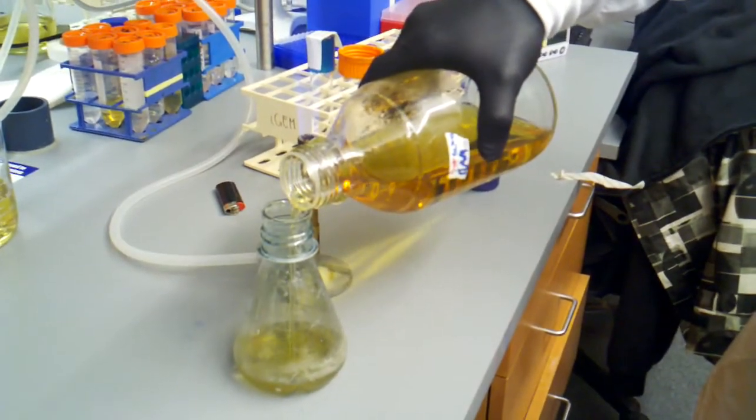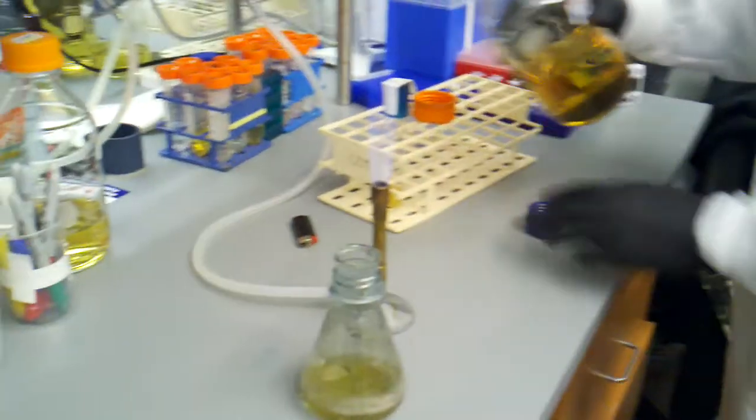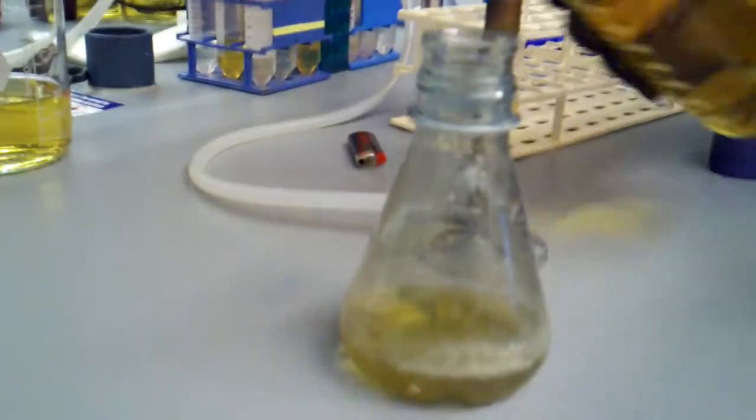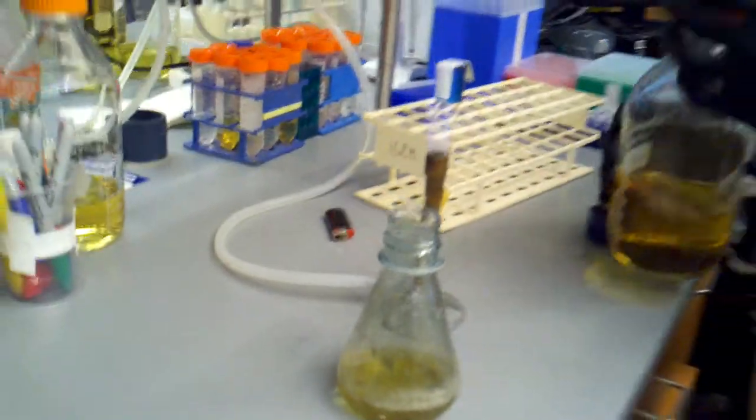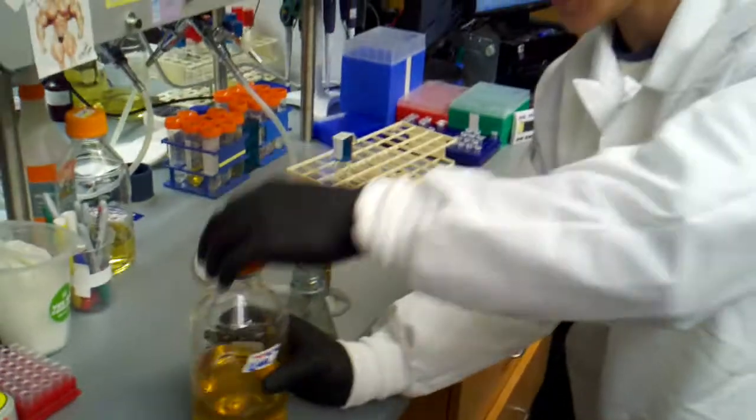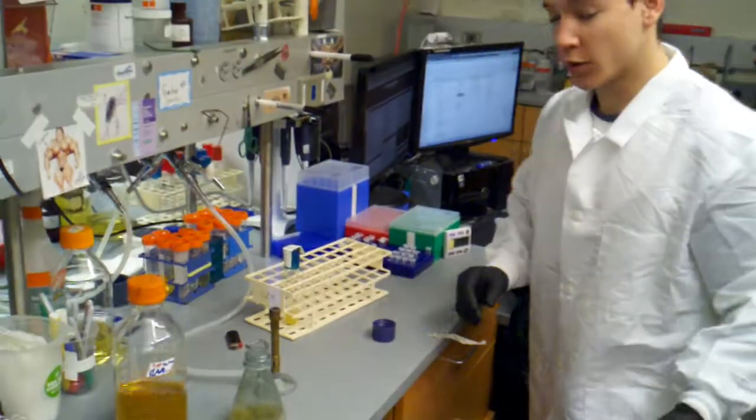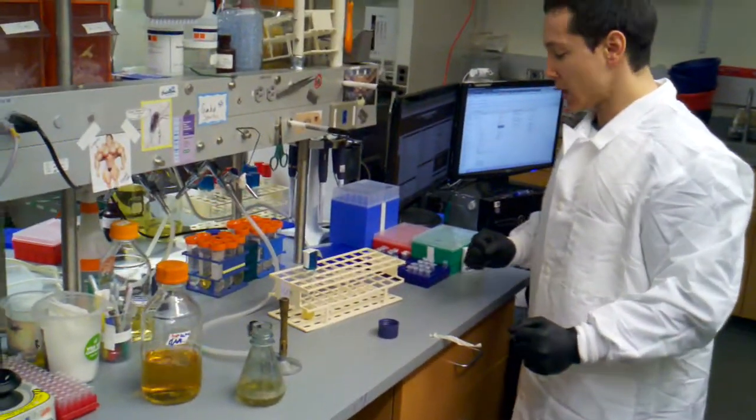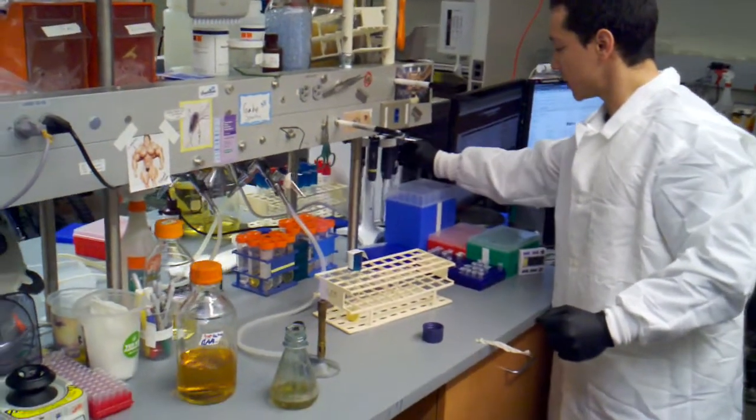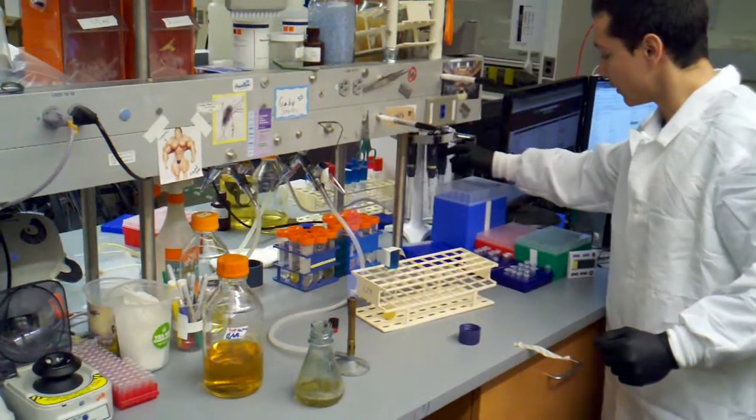Pull it up. That's about 50 mils. If you want to get more accurate, you can just grab a falcon tube. Those are 50 mils, and you can just add your media to your falcon tube. We're going to do a 1 to 25 dilution, so 50 mils is going to get us 2 mils for a 1 to 25 dilution.